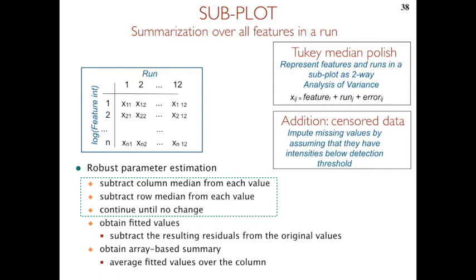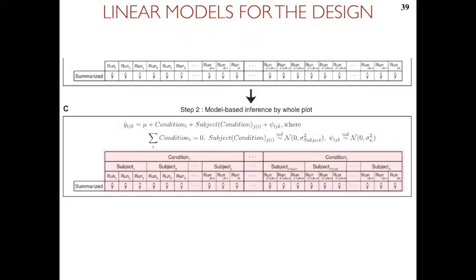So this is just a little bit more information on Tukey median polish. So that's how it works. But essentially, again, we just look at this 2-way table and we summarize by rows and by columns using medians as opposed to means, because it is more robust. Okay, and then the last part actually becomes quite standard statistical modeling. So if we only have 2 groups, no technical replicates, that's exactly the t-test we discussed. If it's small groups, we can have this analysis of variance models where we can look at contributions to variation from different sources.